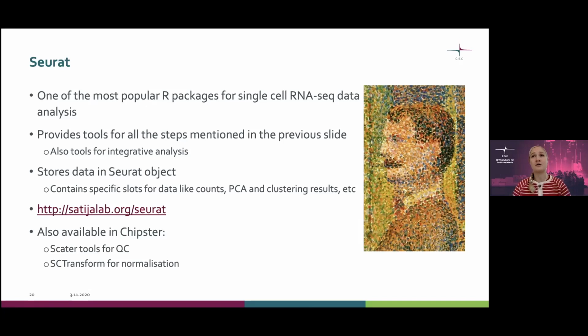So if you want to, you could follow the same exercises using the Seurat tutorials, because we are following very carefully two of the tutorials that they have on the Seurat web page, which you can see the address here. And similarly, we store the data in these Seurat objects. So it's a massive object that contains all the information in one big block. And in Chipster, you can move these R objects back and forth. So you can import them from R to Chipster, and again from Chipster to R, if you want to move between these two platforms.